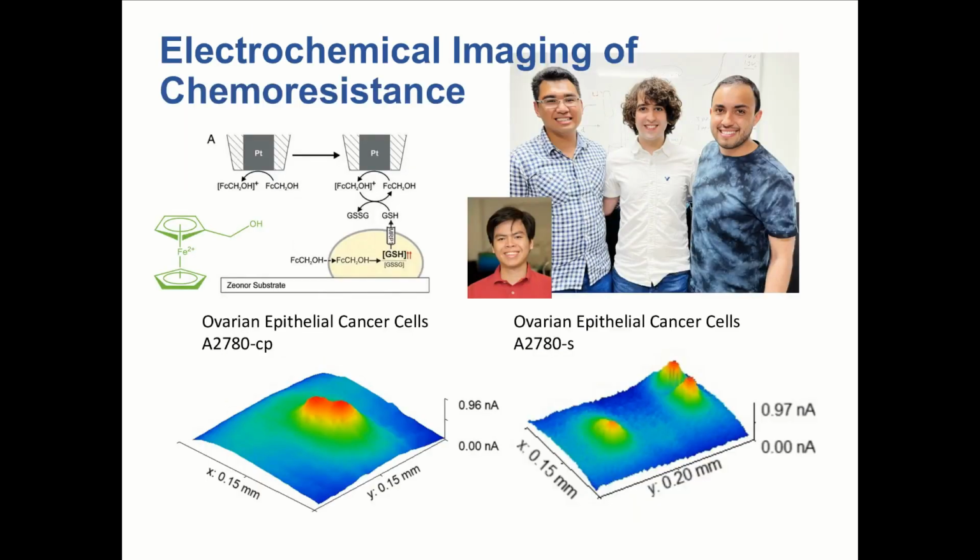Okay, so now I'm going to show you how we investigated chemoresistance mechanisms by SECM. We are looking here at intracellular mechanisms. We have done similar studies to what I've just shown for bacteria with these cancer cells, where we did not get a significant difference between cells that we know are resistant to a certain chemotherapeutic or susceptible. So that led us to think about what we can do to investigate intracellular mechanisms.